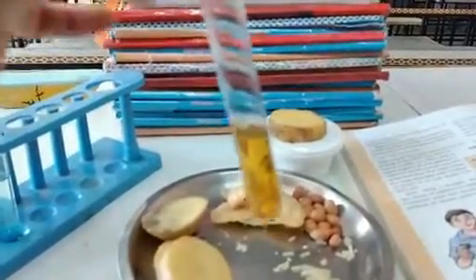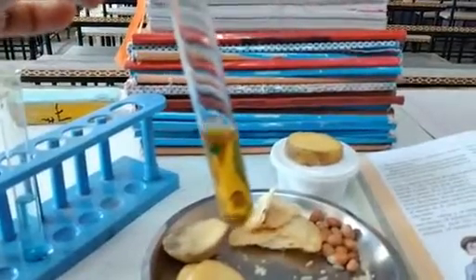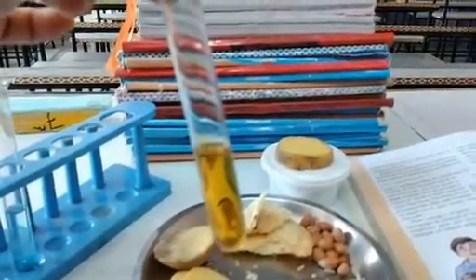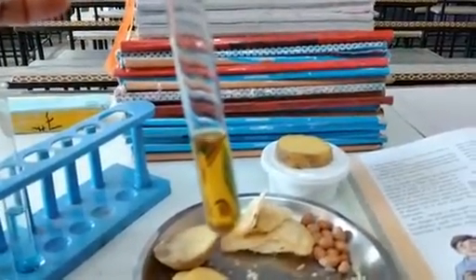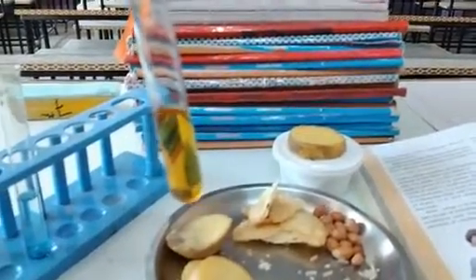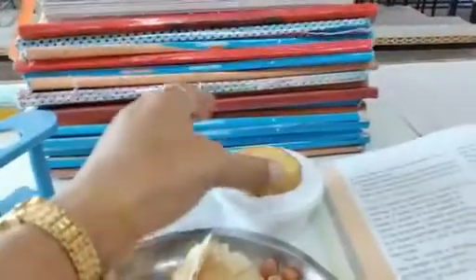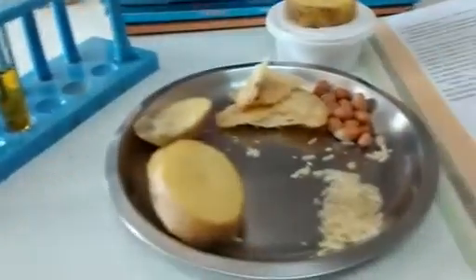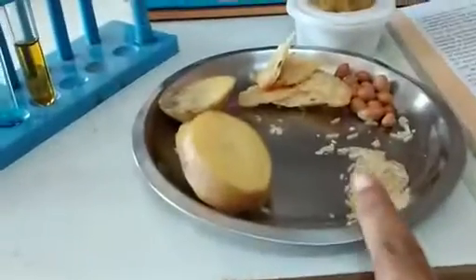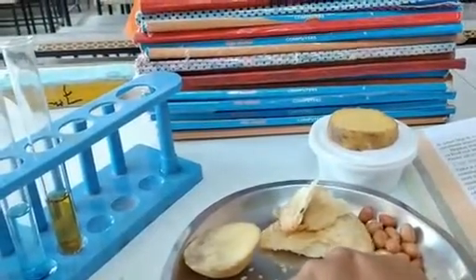Another test tube contains diluted iodine solution. I have taken concentrated iodine solution and in that I have added a few drops of water and diluted it. Then you can see potato slice, rice, then peanuts and fried puri.